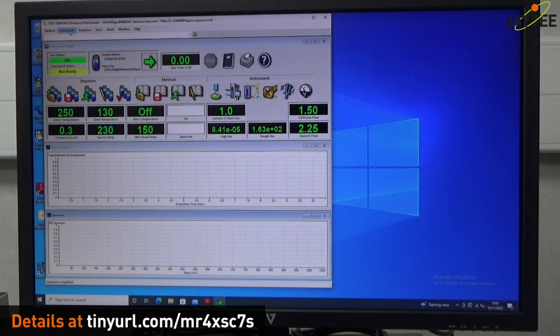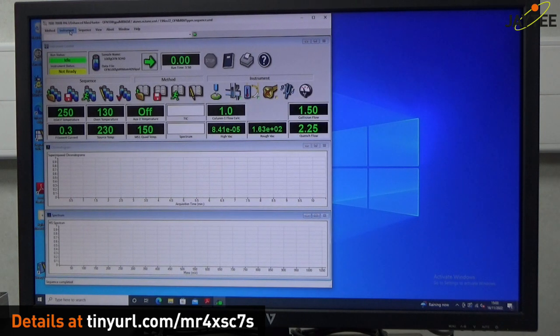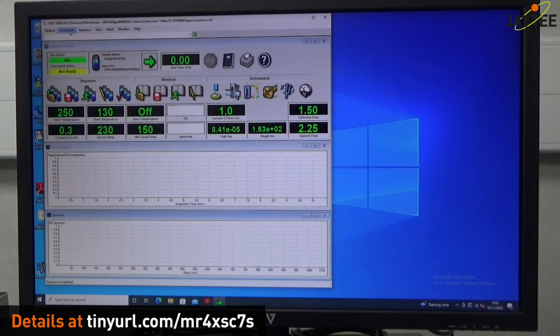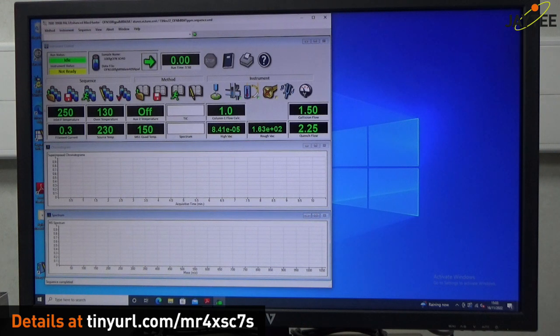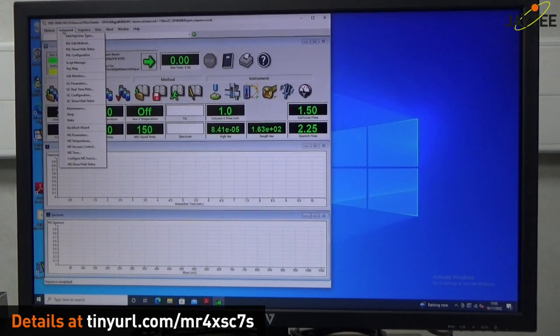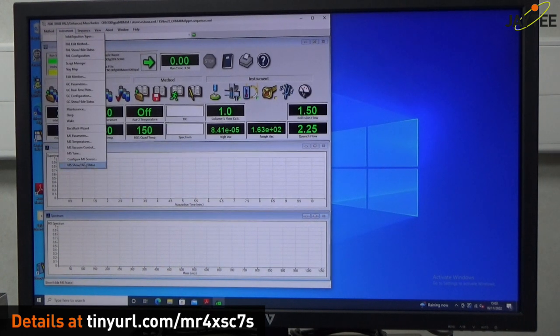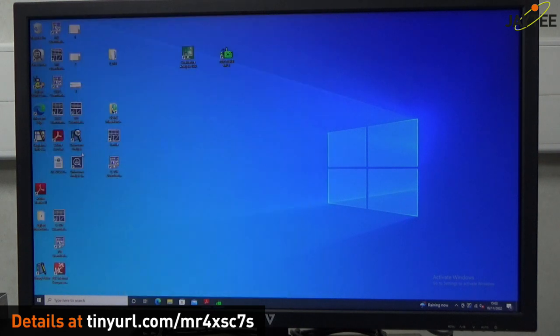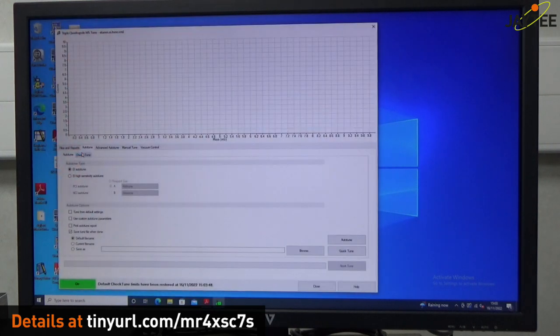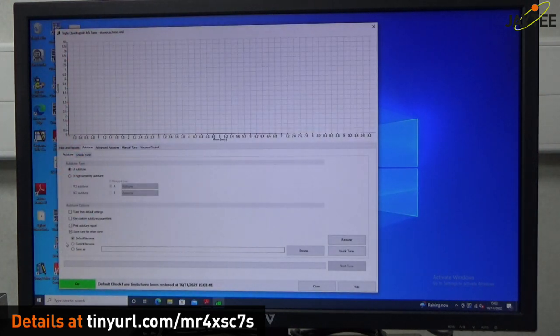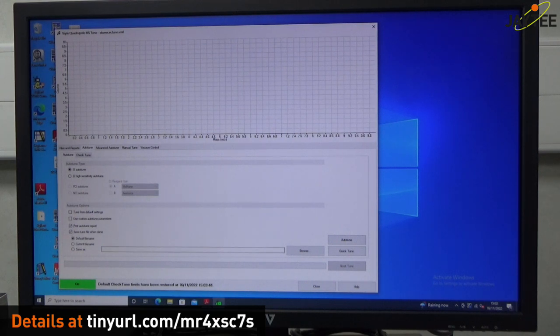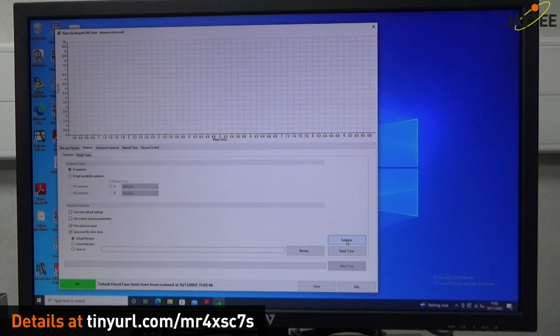So tuning is done at the instrument normally at the beginning of a run or beginning of the week. I'm just going to show you here at the end of the run how easy it is to tune this. So basically you just click on instrument, MS tune, okay. And then we'll get it to print out the data. And then we'll just get it all to tune.